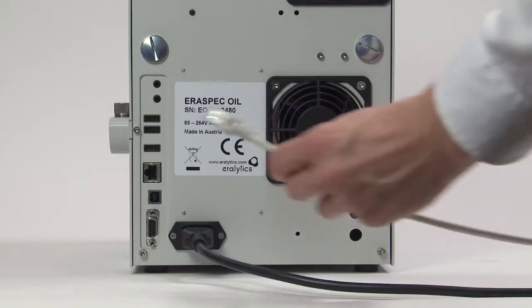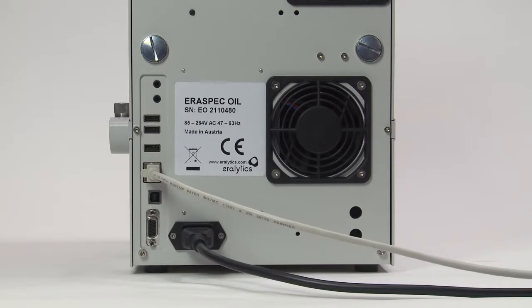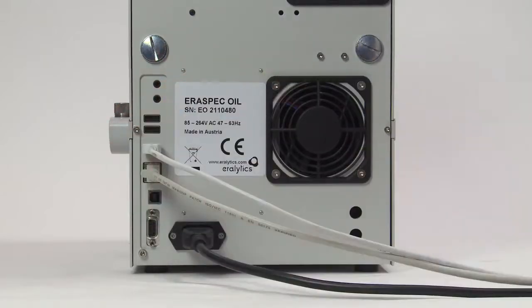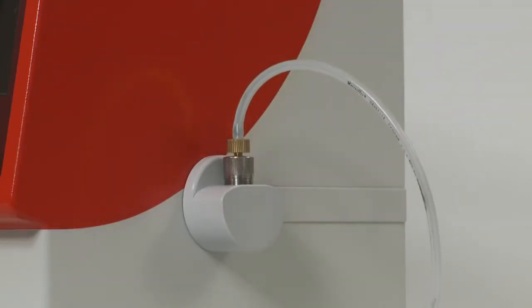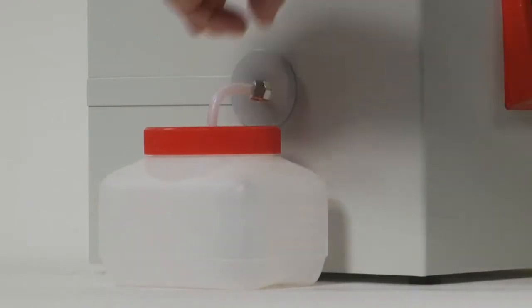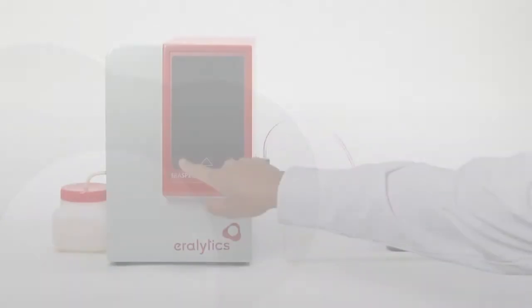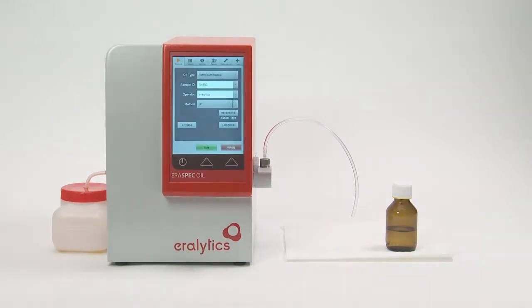For data transfer or remote control, the unit can be connected to a network by the Ethernet interface or directly to a computer or printer using the USB ports. Put the inlet tube in the inlet on the right side of the instrument. Then place the waste container next to the instrument and connect the outlet tube to the outlet on the left side of the instrument. Switch on the analyzer by pushing the power button on the front.